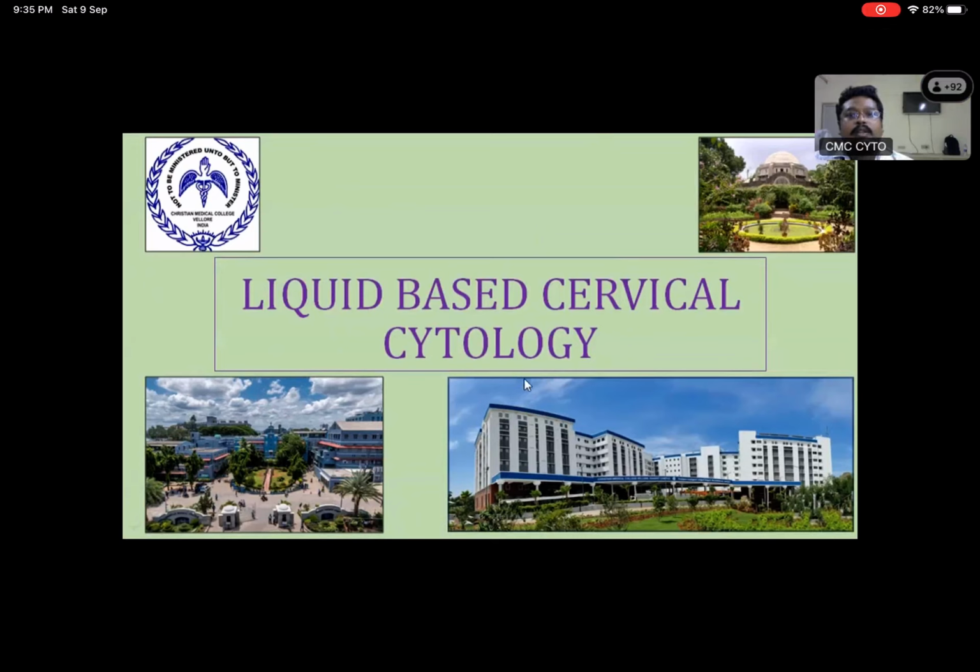Okay. So good evening, students. We'll be going through it like this. Initially, we'll start with a little history of cervical cytology, and then we'll discuss the adequacy criteria, what are the techniques we use, and the difference between conventional and liquid-based cytology. Then we'll be seeing some pre-test images, which you can just quickly note down the answers to yourself. And after that, we'll go into the cases.